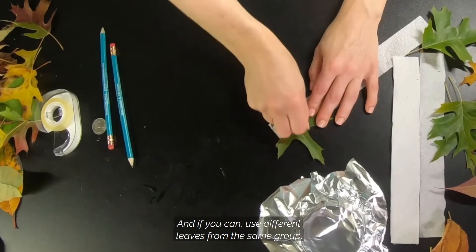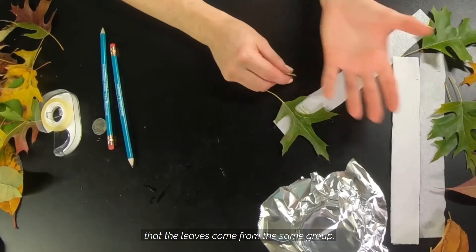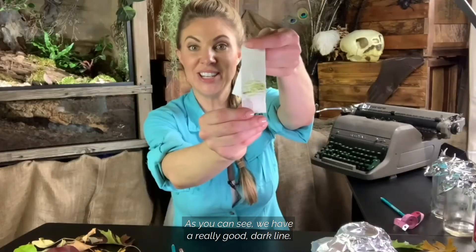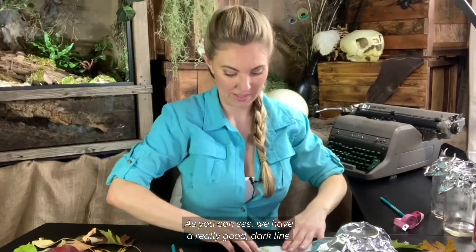If you can, use different leaves from the same group. It's important that the leaves come from the same group. As you can see, we have a really good dark line.